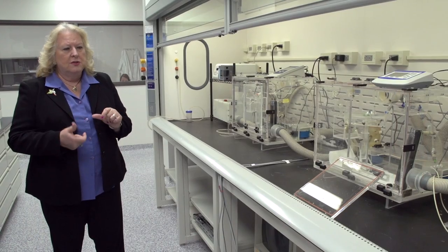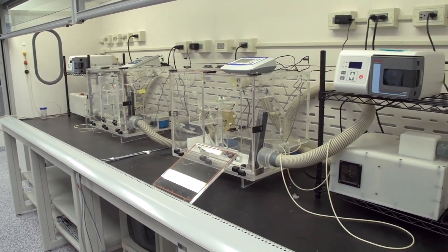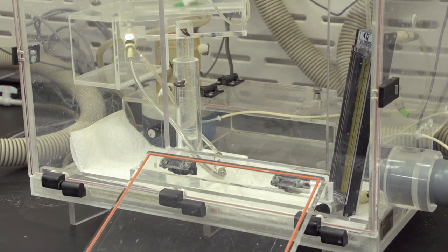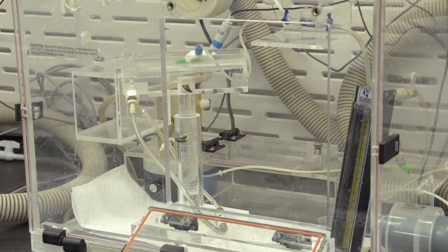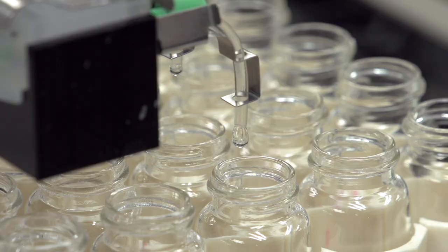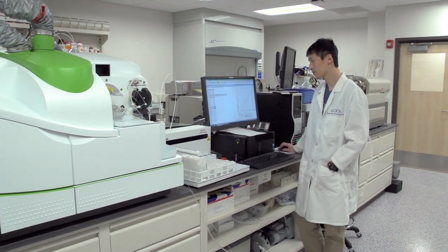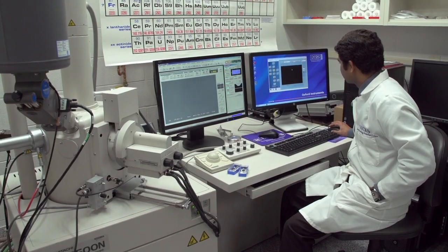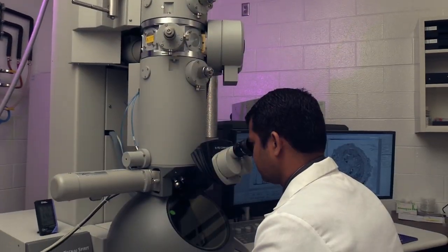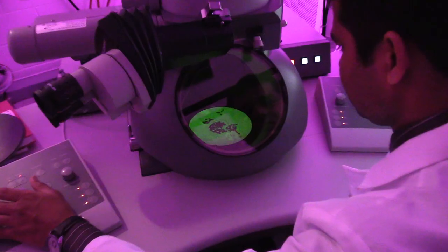NICKS director Dr. Nancy Montero Riviere's research has focused on assessing the toxicity of nanomaterials and how nanoparticles interact with cells and proteins in biological systems. Current research has been focused on the cellular uptake of nanoparticles, describing the protein corona formation and biodistribution in skin. NICKS is also home to an advanced analytical laboratory and an electron microscopy facility featuring both transmission and scanning electron microscopy. This facility is available to assist researchers from NICKS, as well as other investigators from across and beyond campus.